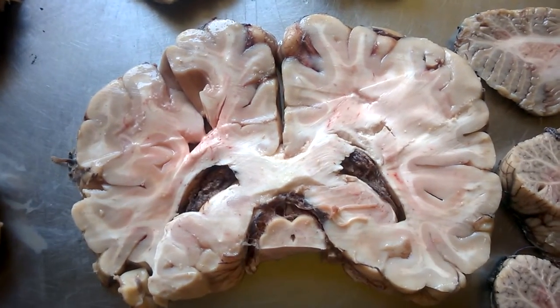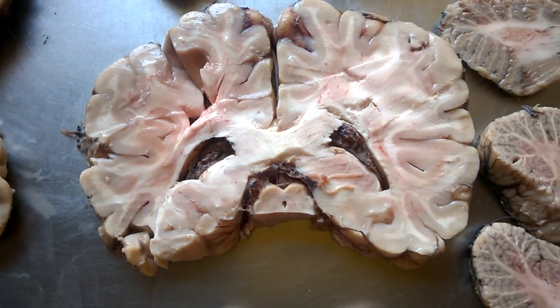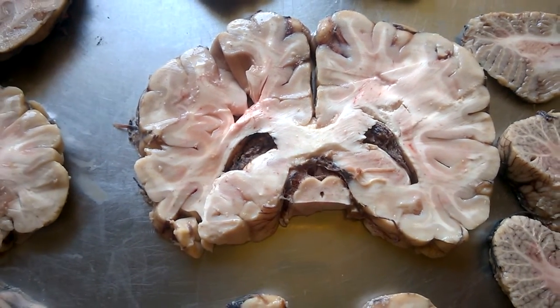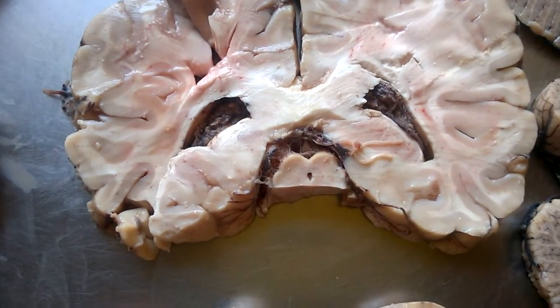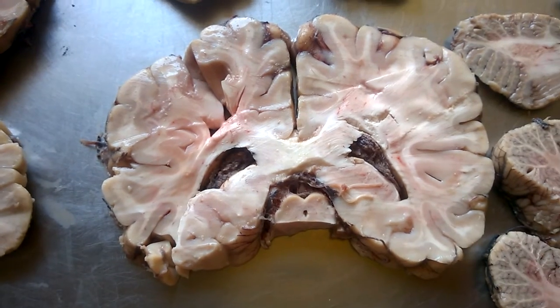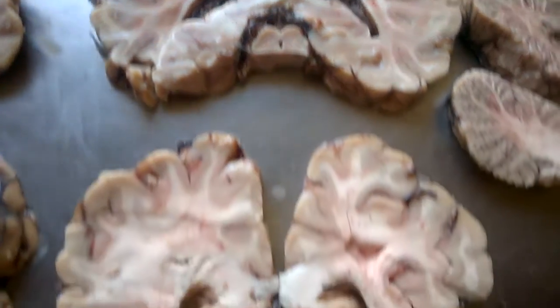From the lateral ventricles through the foramen of Monro, the cerebrospinal fluid goes into the third ventricle, and from the third ventricle, through the aqueduct of Sylvius, the CSF will flow into the fourth ventricle. And that is it here.